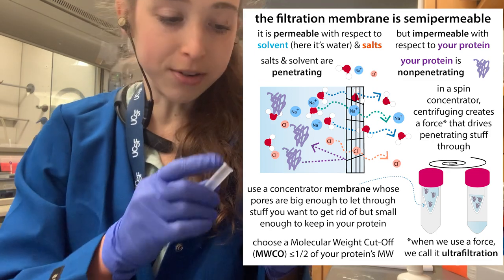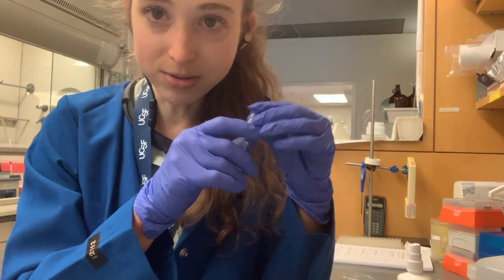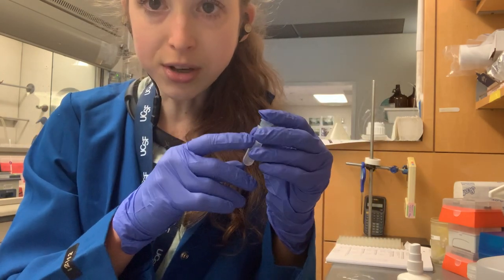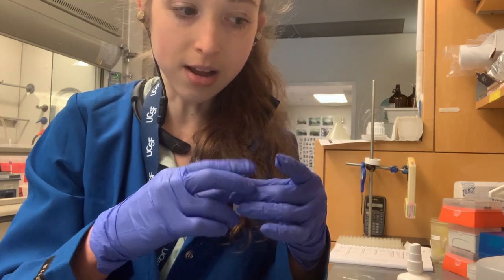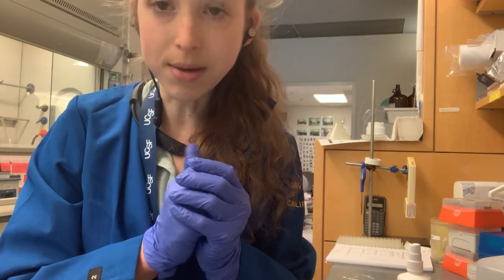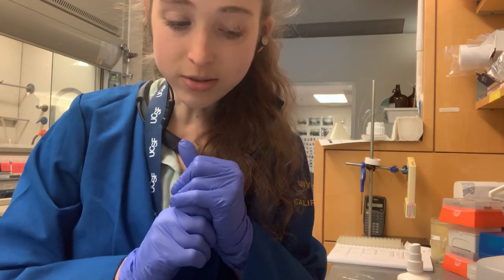One time I thought I'd be clever and write on the inside of the column so that when I pulled it out I wouldn't get confused. But then the ethanol made the ink run into my sample, and yeah, it was a mess. So be very, very careful when you are using those.